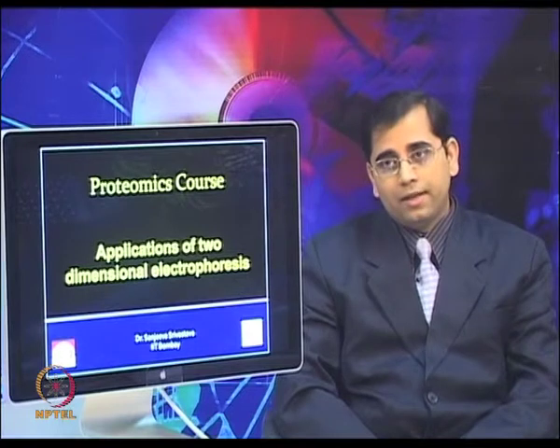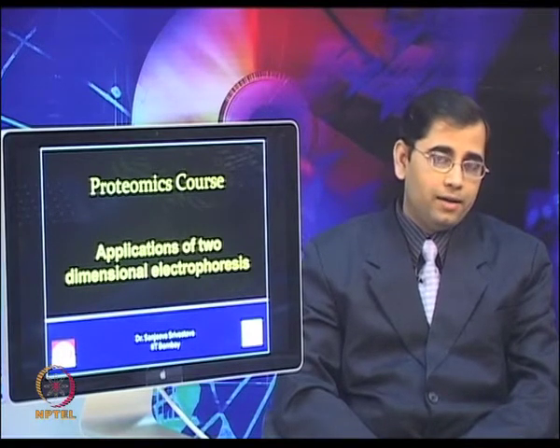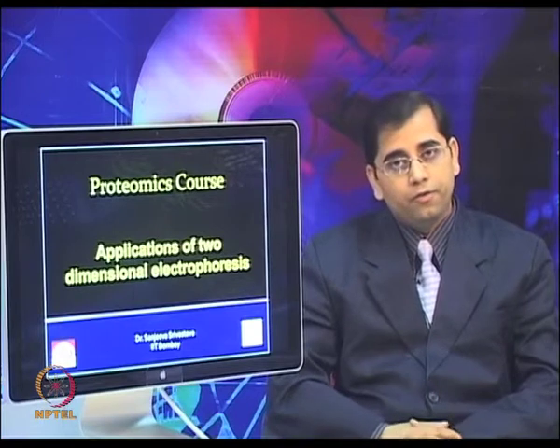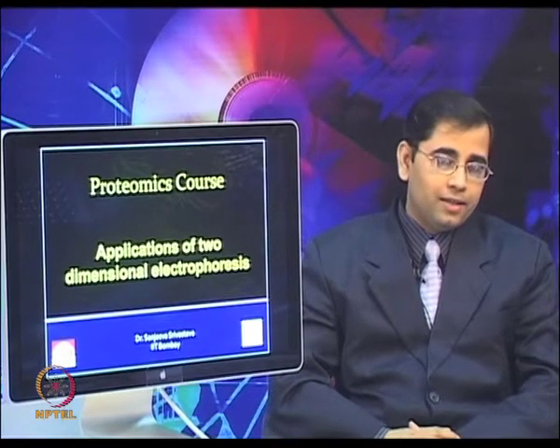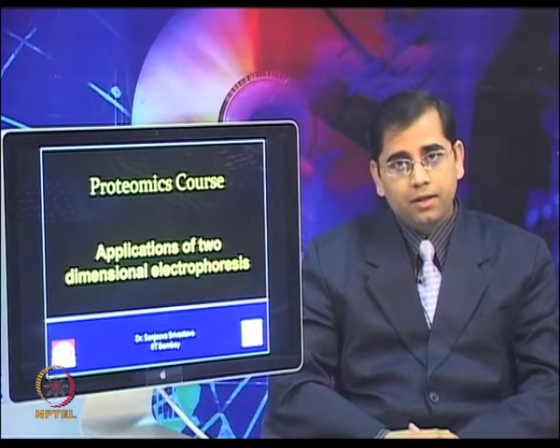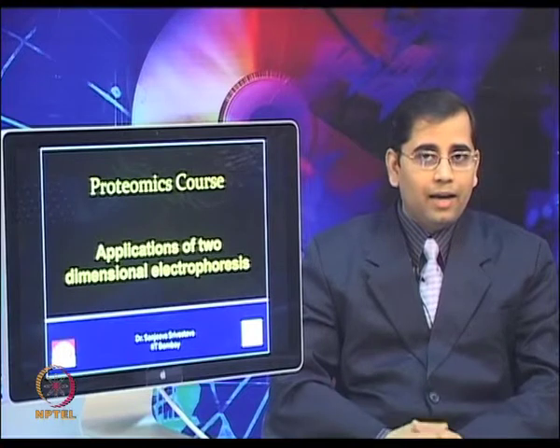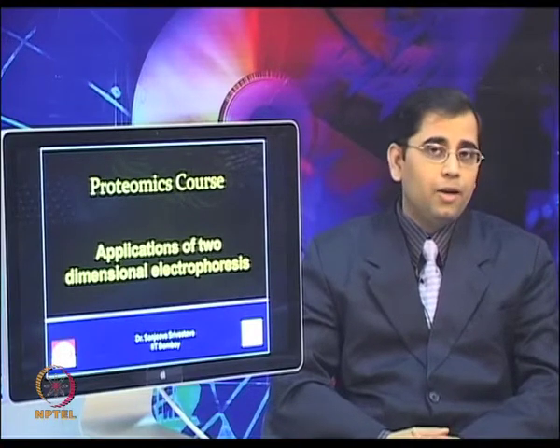Now, this is time for us to assimilate all the knowledge which we have acquired during the last several lectures. For example, what are the things one needs to take care of during protein extraction, then isoelectric focusing, second dimension protein separation, followed by gel analysis. All of this knowledge integrates when you want to apply these techniques in any biological application.